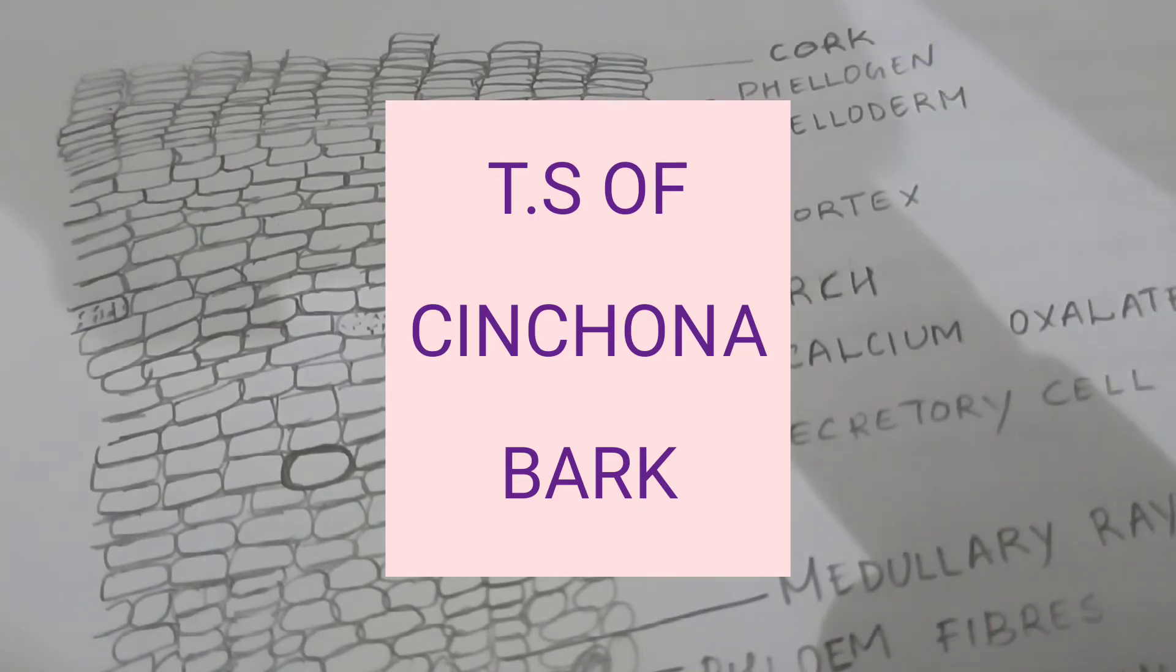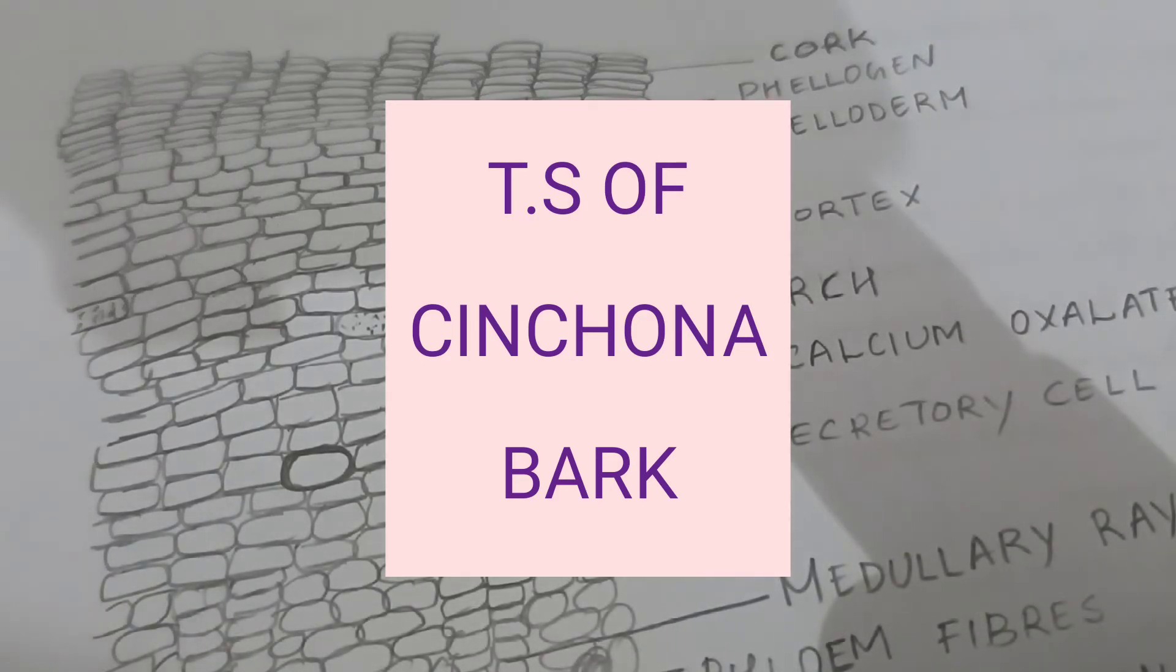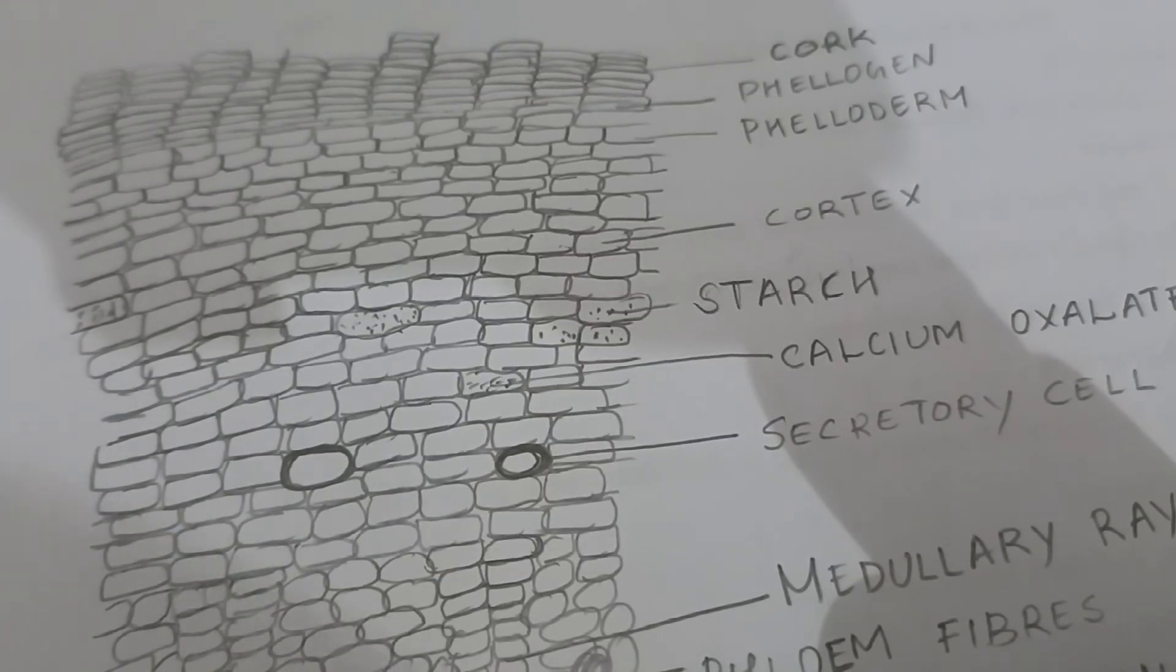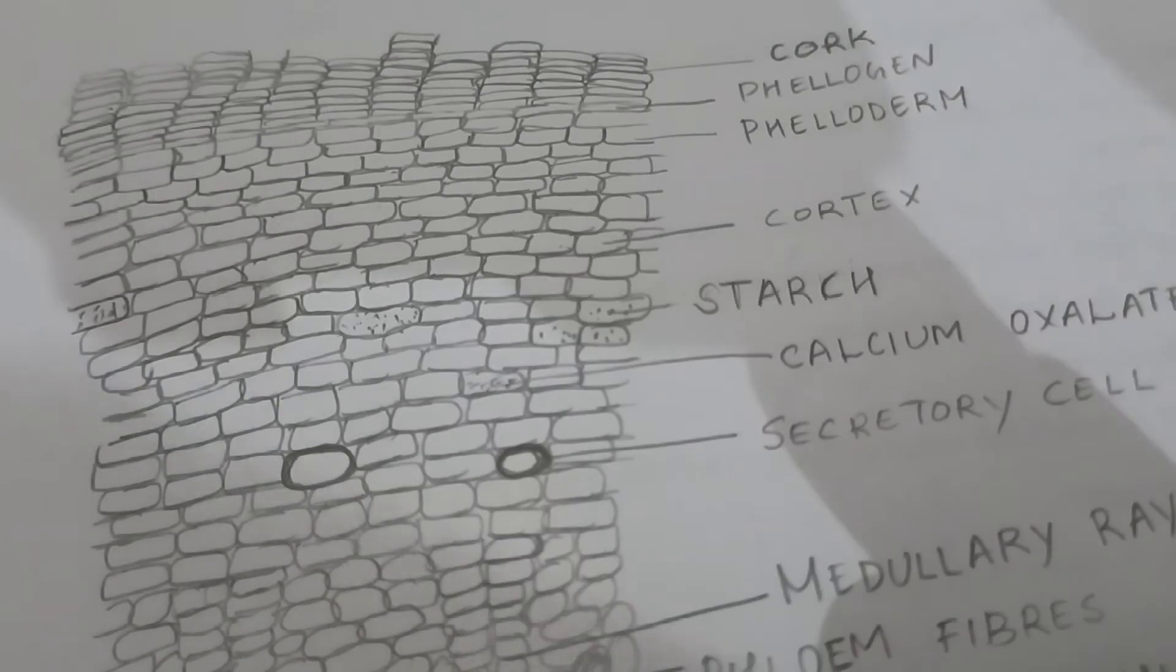In this video we are going to study the transverse section of cinchona bark. It shows a well-developed periderm, a wide cortex, and a large secondary phloem.